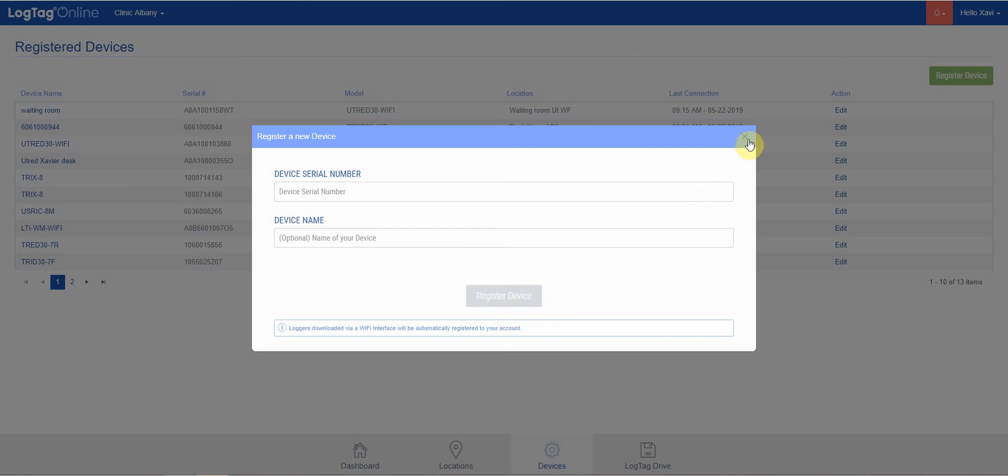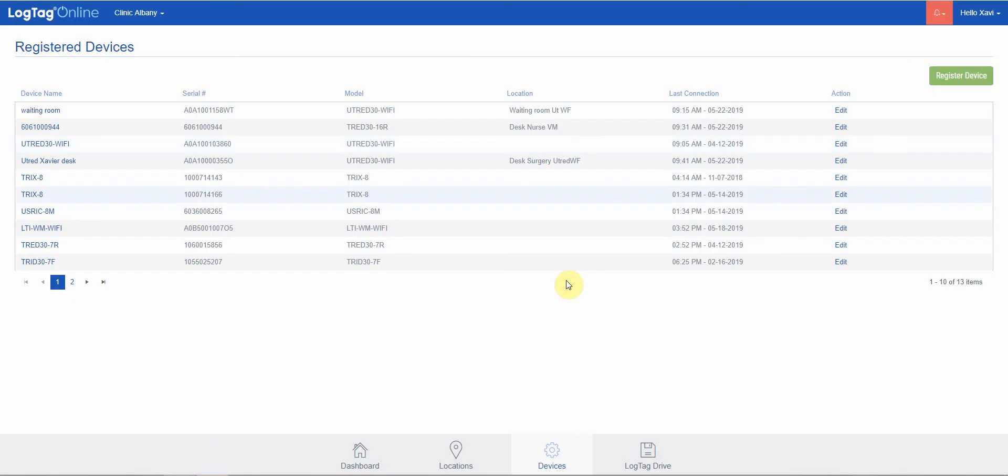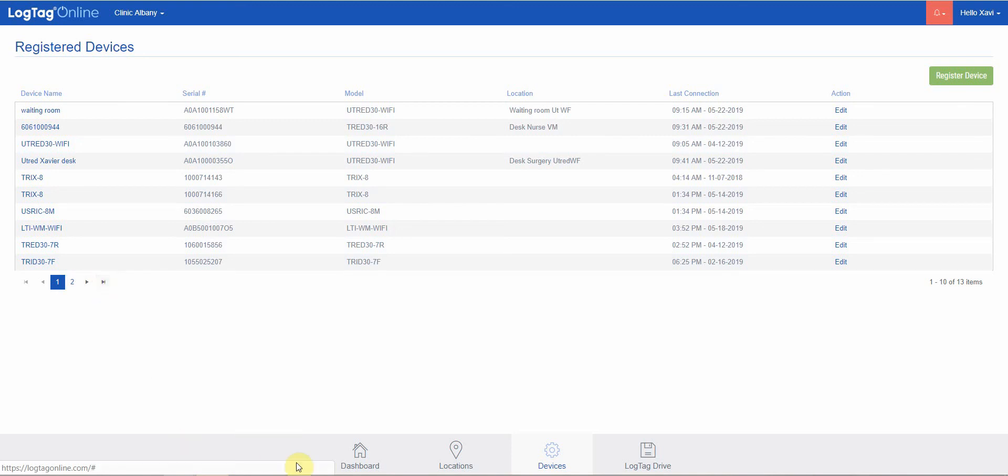And then that would appear in the list, ready to be attached to your location. That concludes registered devices. Thank you.